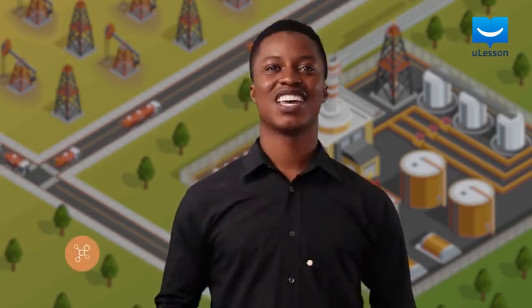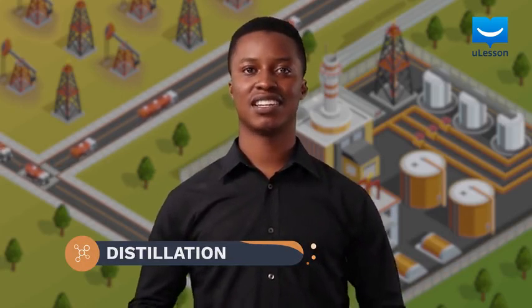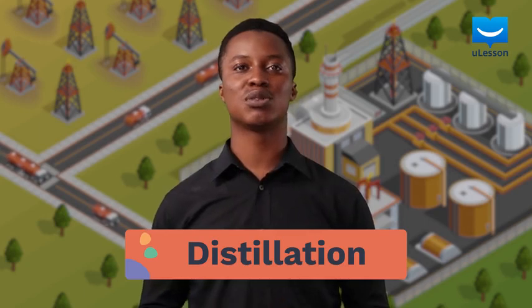So hey there guys, we have thus far looked at a lot of separation techniques, 9 to be particular. However, none of these separation techniques describes a means for separating two or more liquids that are completely mixable. At this point, the technique termed distillation comes in handy. Now, distillation as a separating technique is used in the separation of two or more liquids that are completely mixable.